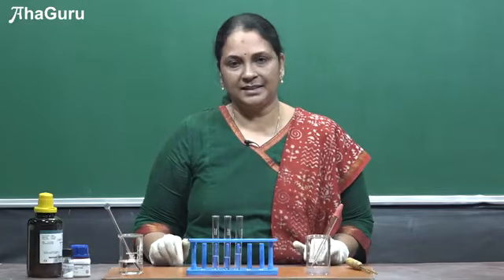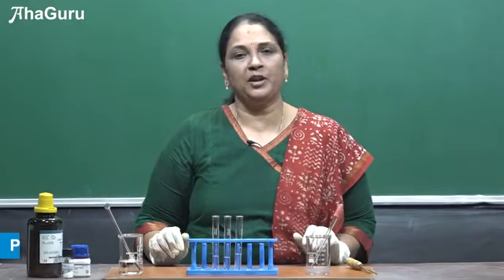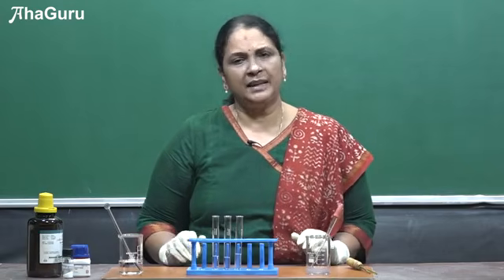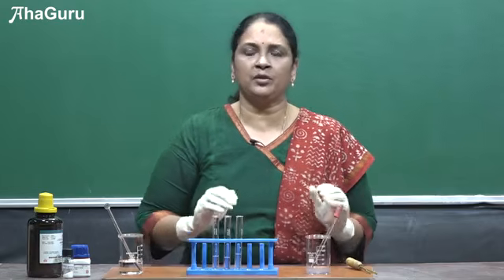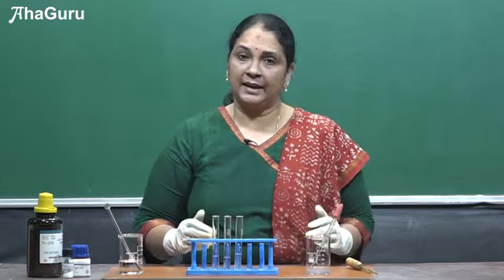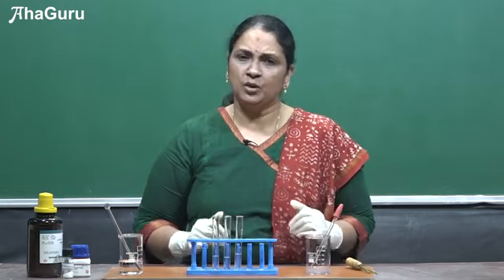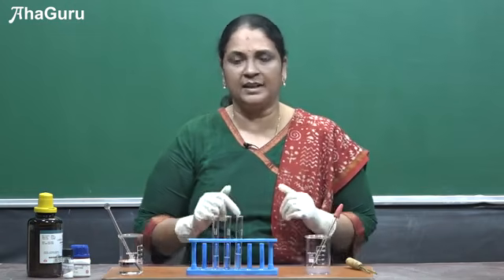Hi, let us see some experiments today. Today we are going to see the test for halogens, that is chloride, bromide and iodide. These halogens can be part of inorganic salts like NaCl, potassium iodide, or these ions can be part of organic compounds. We have already seen in qualitative analysis of organic compounds that halogens can be present in organic compounds. So today let us see the tests for these ions.